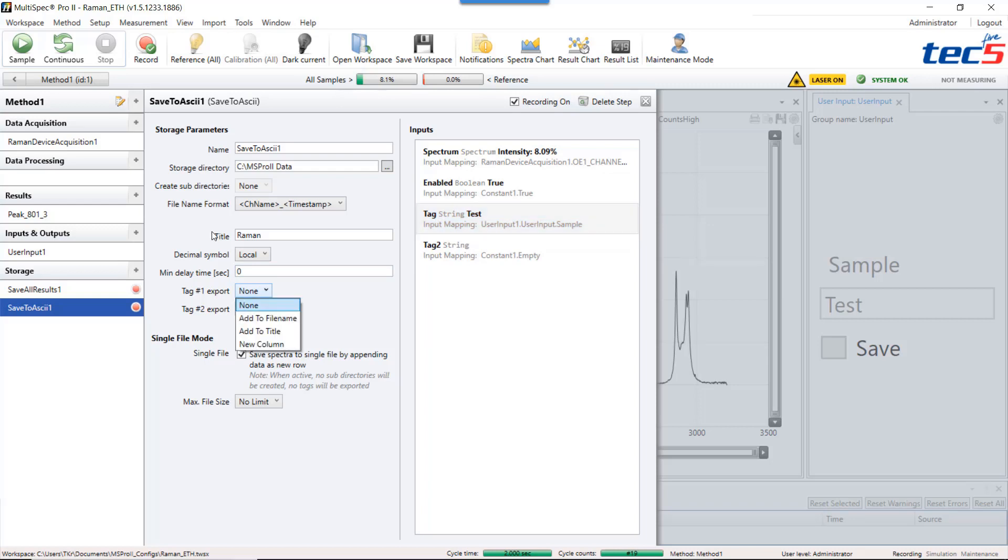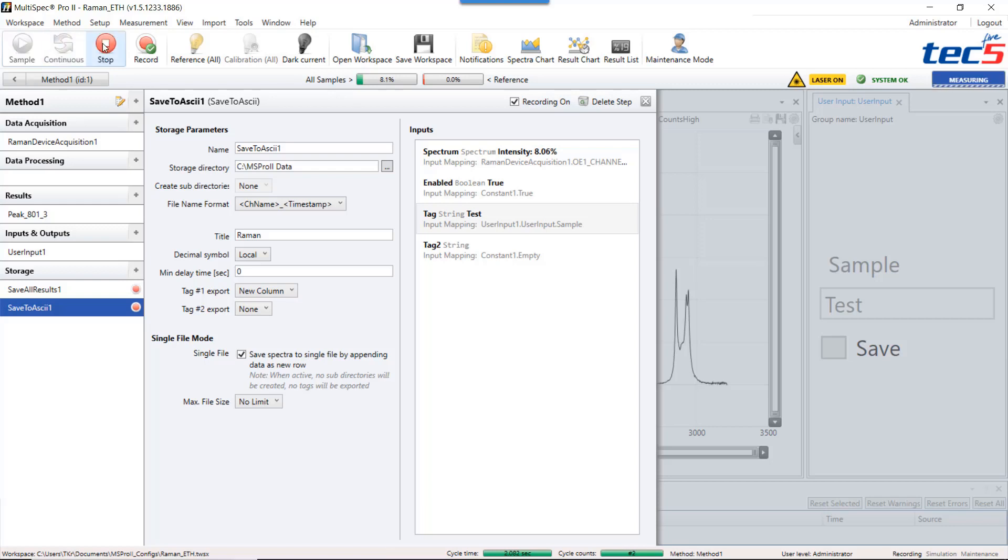And define what should happen on the export. I select new column. With every measurement cycle Multispec will now add a spectra to the file in the storage directory, and in the last column the sample name sample description will be stored.